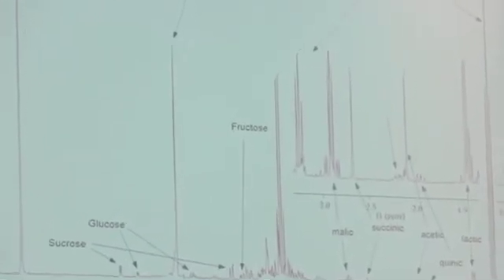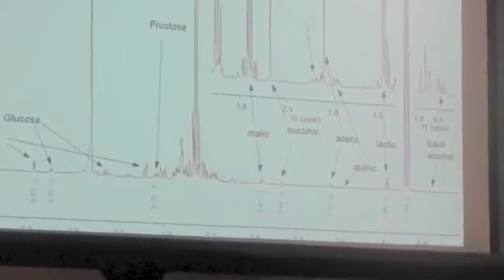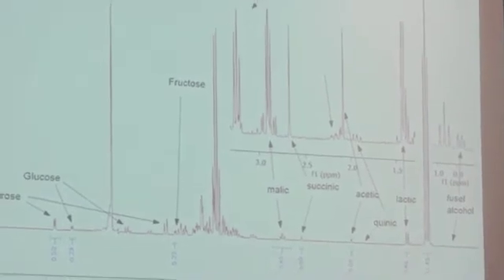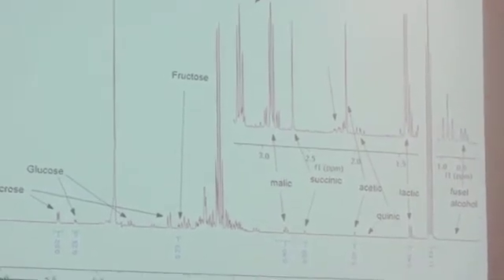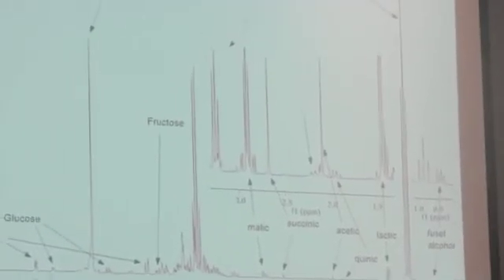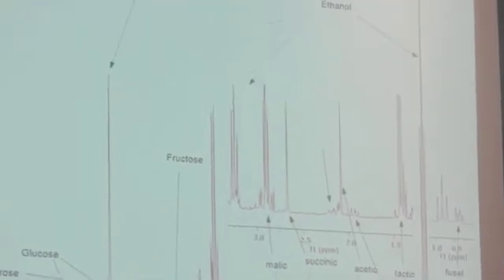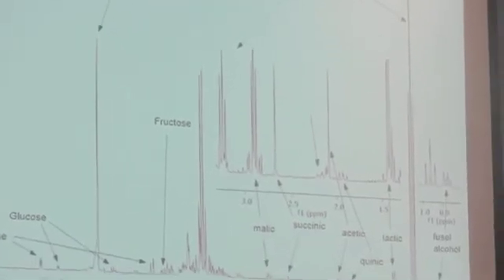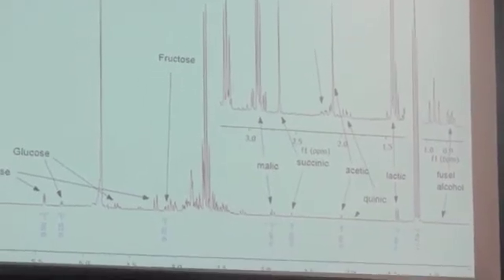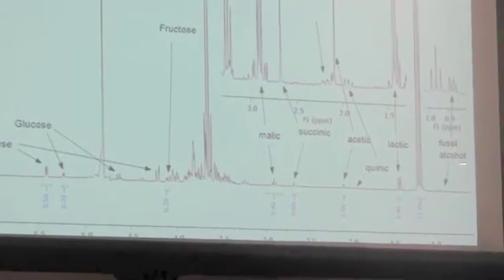This never changes. If you're doing HPLC, you have to buy standards and calibrate the columns and make sure that the peak coming out at 2.5 minutes is that molecule. And then every molecule that you look at has a different response factor to the detector. Depending on the chemistry of the molecule, the size of the signal you get at the detector changes, so you have to know everything about every molecule, and it's a pain in the butt. Whereas this is just really straightforward.